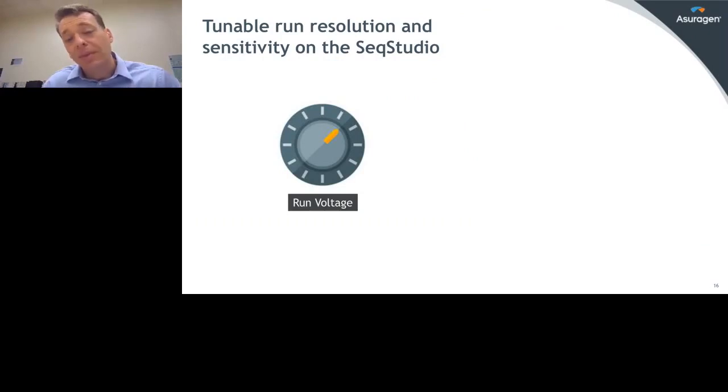So the assay has the capability to indicate these types of variations, and with the right platform, you can get a very good sense of any offset and changes associated with insertions and deletions, which can be very powerful for getting a lot of information from one simple workflow.